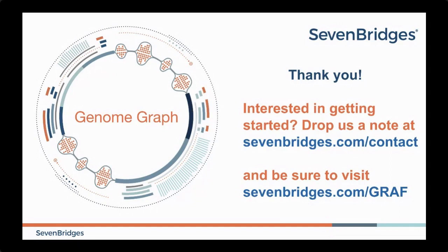Next question is from Durga Adipalli. Sorry, I joined late. Do the graph workflows use GPUs? And if yes, can a user configure the GPU usage? So we don't use GPUs because the read alignment and variant calling problems are not GPU friendly.